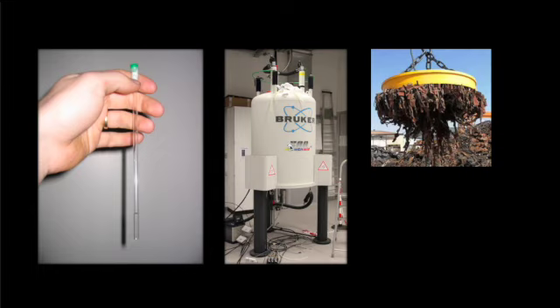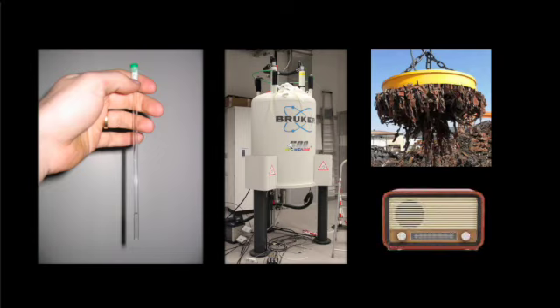So that magnet will influence those little tiny magnets of our hydrogen atoms. The NMR also has a radio wave generator. So it sends radio waves.